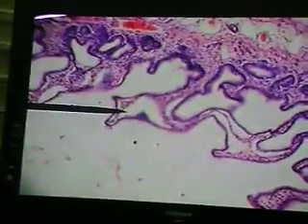Okay? And this is the subserosal connective tissue right here, where we expect to find some of the blood vessels, etc. So this part of the gallbladder has a peritoneum. And there you can see some fat below it, or deep to the peritoneum. But a part of the gallbladder now lacks the peritoneal lining and has an adventitia. And that's the part that's applied to the visceral surface of the liver.